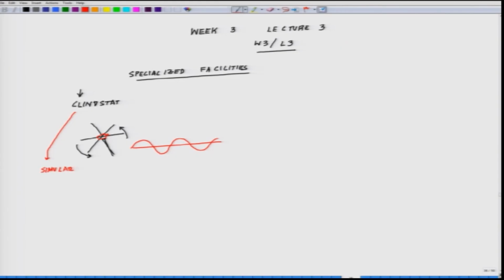Their whole idea is to simulate zero gravity, or rather, zero gravity is really tough to simulate. It is basically a microgravity situation, to see how cells grow in that kind of situation. So you have a cell growing dish from which nothing will spill over. Inside, it is sealed properly, with of course proper gaseous exchange, and it is moving in this clinostat.